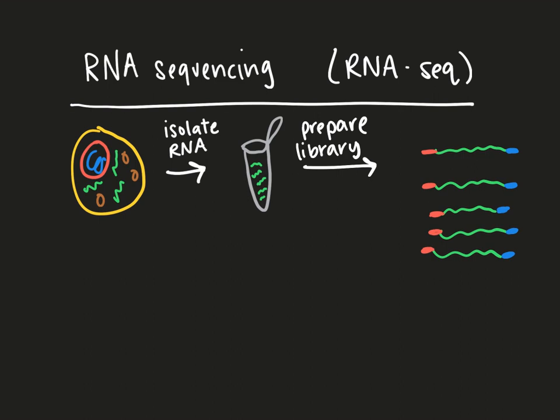So yeah, I'm being very vague in all of these steps because it is not my intention right now to show you one specific protocol for RNA-seq. There are many protocols for RNA-seq, but it is important that you know that usually this involves adding some sort of adapters, some sort of sequence to either end of the actual RNA that can allow this read to be read by the sequencer machine. And this is true of all sequencing platforms. I've been glossing over it a little bit, but it doesn't matter if you're sequencing DNA in a whole genome sequence or you're doing an RNA-seq project. You will have to prepare these nucleotides in some way such that they can be accessed by the sequencing machine.